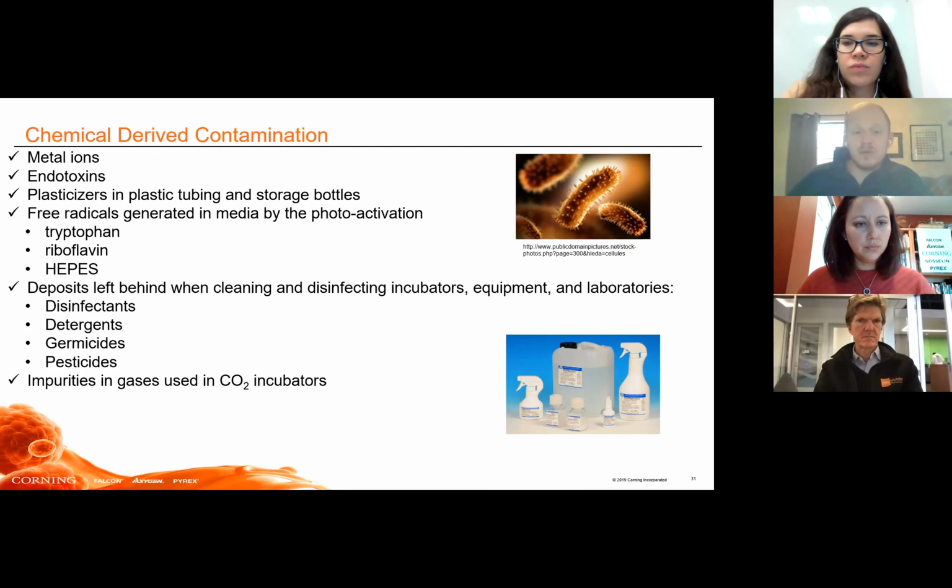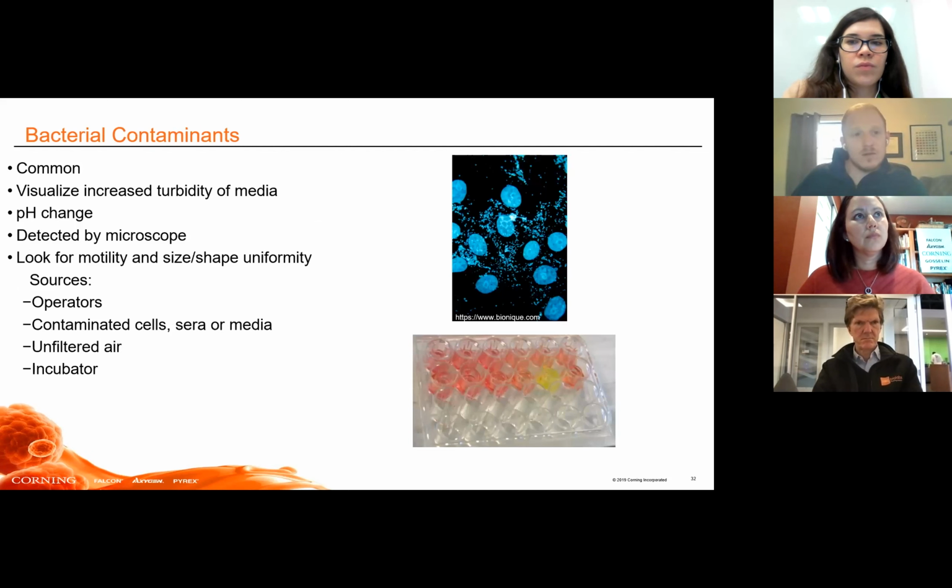And then lastly is impurities in the gases associated with your CO2 incubator. So these are a little bit more hard to identify and usually end up being determined last as the last root cause. But more commonly, it's a biological contaminant that is introduced into the cell culture.